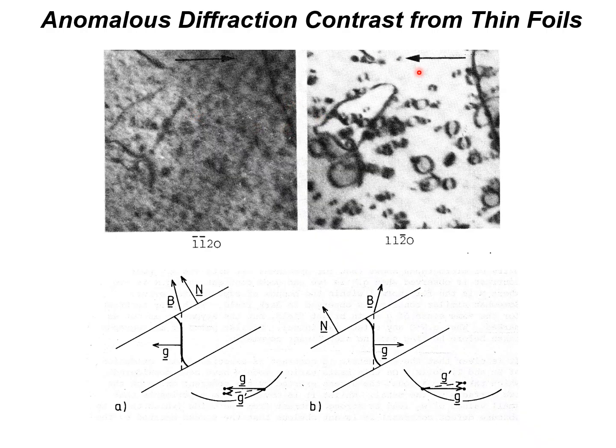In one imaging condition, we have a nice clean image and we can see the dislocation loops, and in the reverse diffracting condition we see poor contrast. Although ostensibly we can see some of the same loops, it's very difficult to identify the loops in both images.